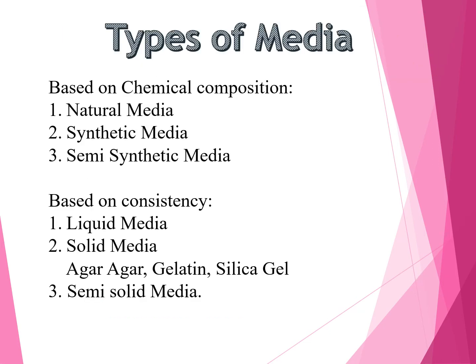Moving ahead, I would like to discuss types of media. We can classify different types of media on many aspects, such as based on chemical composition. Media can be classified into three categories.